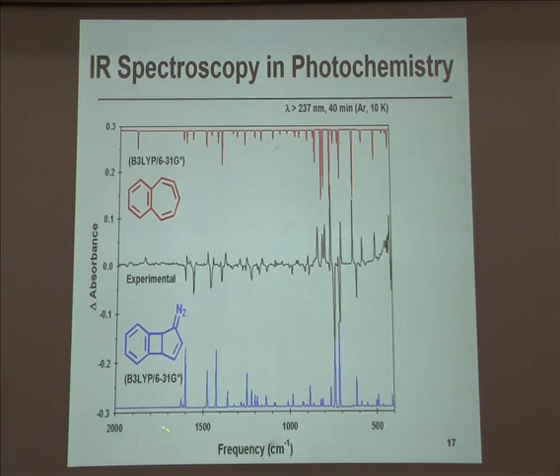Down at the bottom in blue is a predicted spectrum of the reagent, and you can see that there are peaks up above aimed downward that match pretty well to the predicted spectrum below. All of these peaks aimed downward on the experimental spectrum in the middle are those that went away as the reaction occurred. And so this is the way that the folks involved confirmed that the reagent, after irradiation, disappeared by those downward aimed peaks. Every peak that's aimed upward on the experimental spectrum is something that grew in after irradiation.